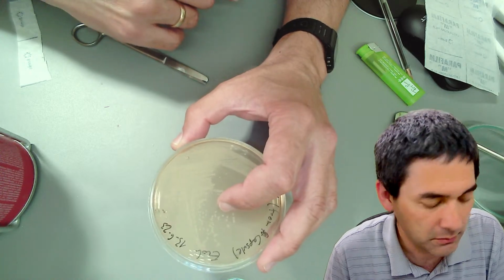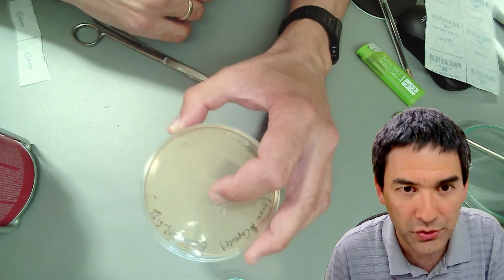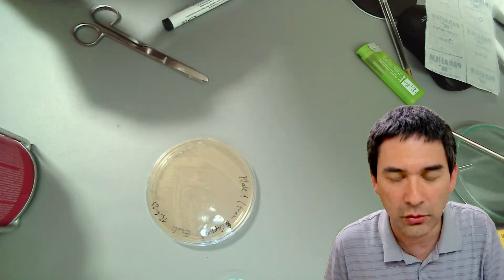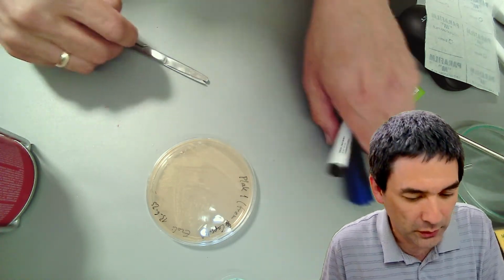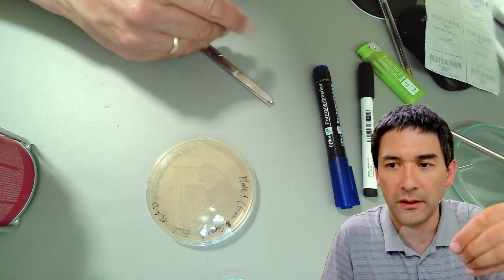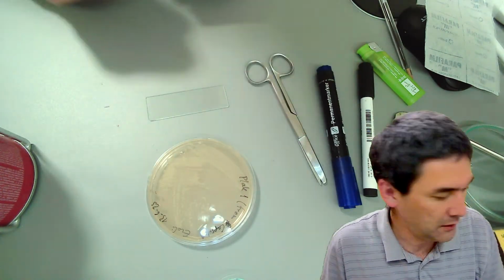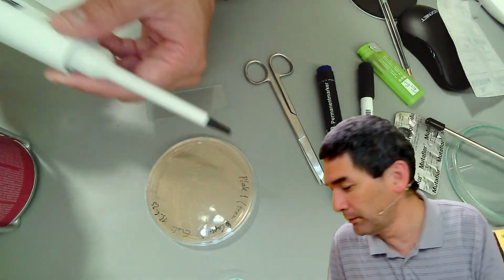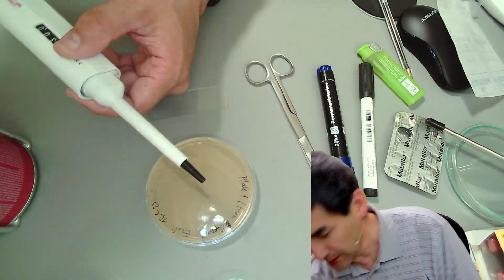And I'm now going to show you how to put it under the microscope. I'll be using this plate over here. Normally, of course, you again have to turn off the flame. And what I will be doing now is I'll be using a slide. Here a slide, and I'm going to put the slide here, and I need a little bit of water. Look, I've got this pipette here, but I forgot where I put my tips. Where are the tips? The tips are in here.